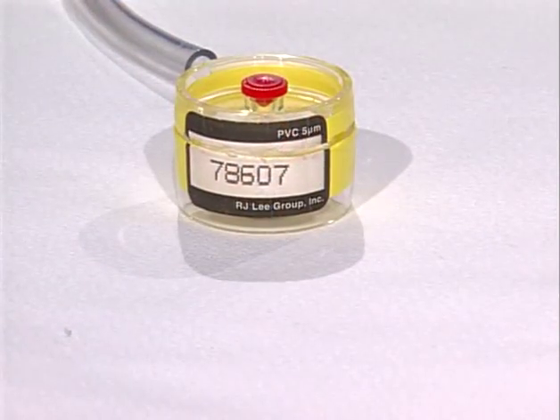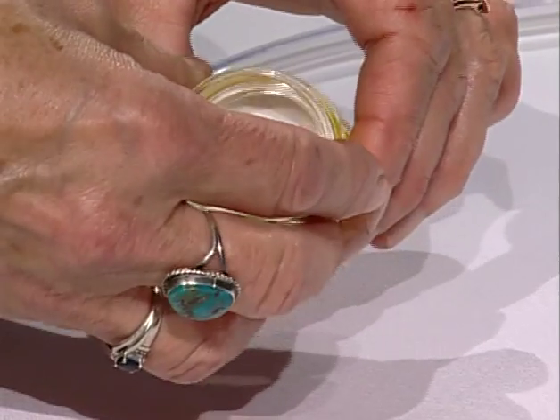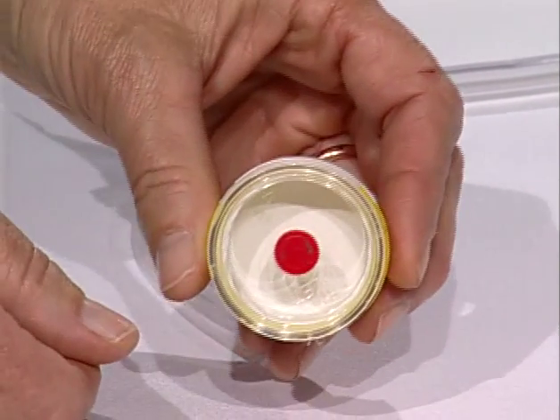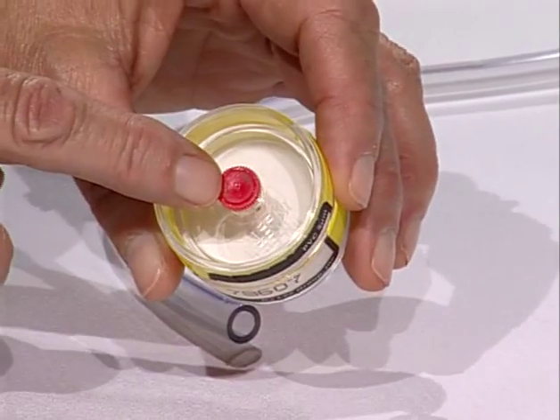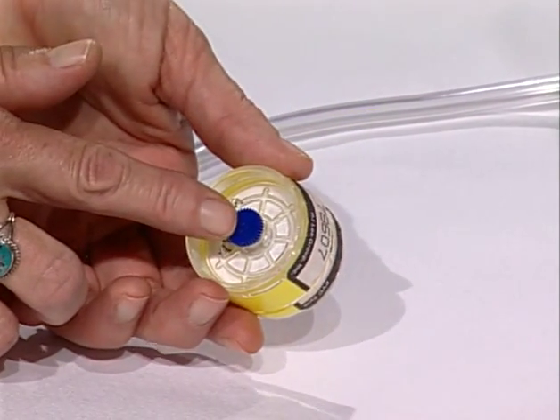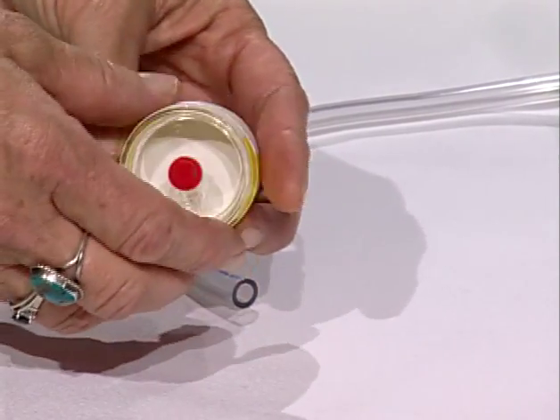Let's take one apart. The reason for doing this is to demonstrate that the cassette can only be attached to the cyclone in one way. As you can see, there are two openings at opposite ends of the cassette. One of these openings is only for inlet air and the other is only for air moving out of the cassette. It is essential that air from the cyclone only enter the opening designated for air entry.